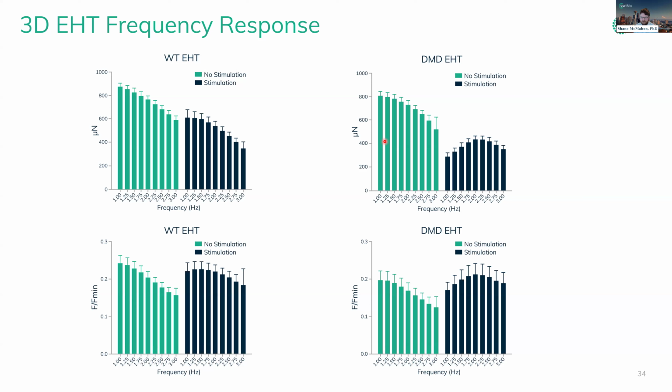I want to share a little bit of that data here. So in this maturation protocol that we tried, these tissues were cultivated first for 21 days, and then a chronic pacing protocol was applied starting at day 21 for 2 weeks. And then these data were acquired on day 58.